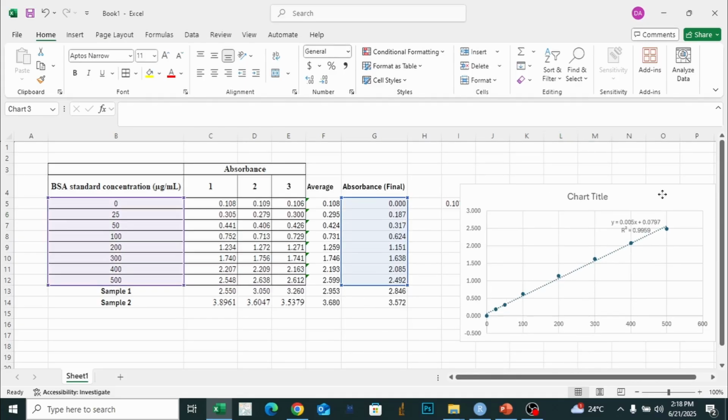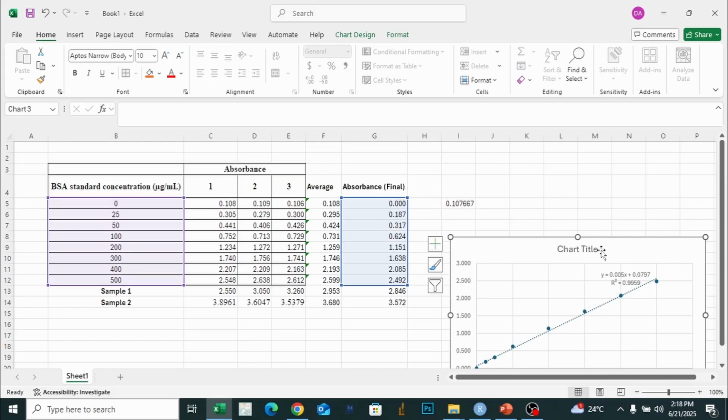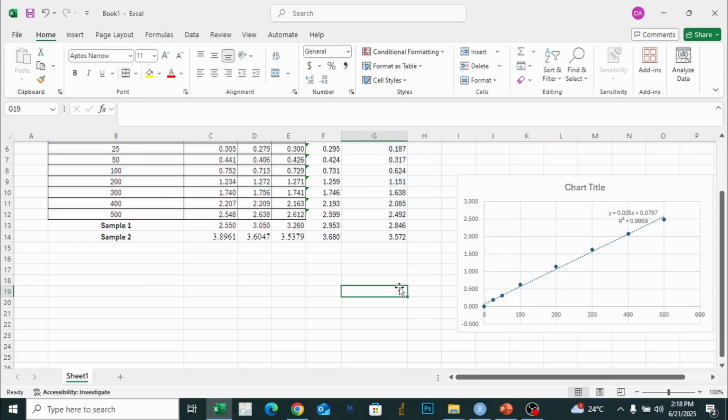Once we get this, what happens is we already have the value for y, but we need to find the value for x. So we have this formula. For example, we can directly convert it, as I already showed, and this is the actual formula we need for determination of the x value.